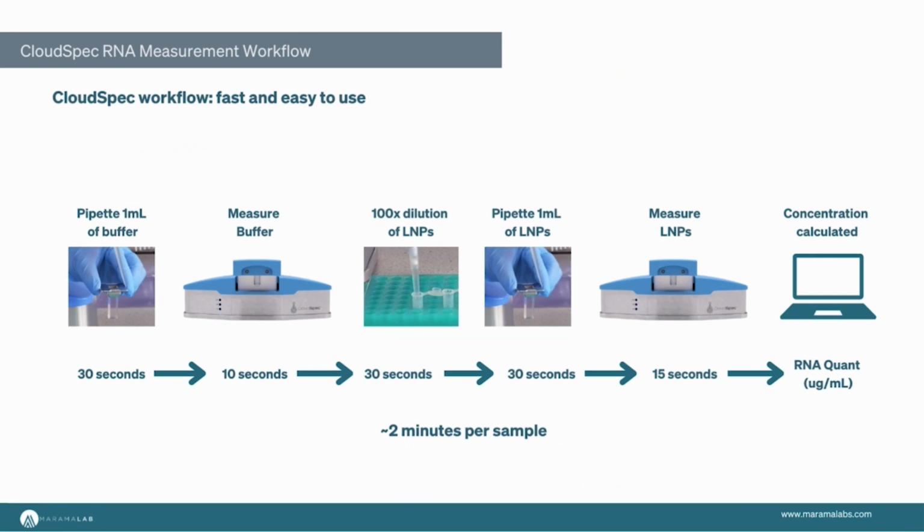In terms of the workflow, well, we measure the buffer, and then we dilute the sample into a cuvette, and we measure that. The measurements take about 15 seconds each. The whole process takes a couple of minutes.